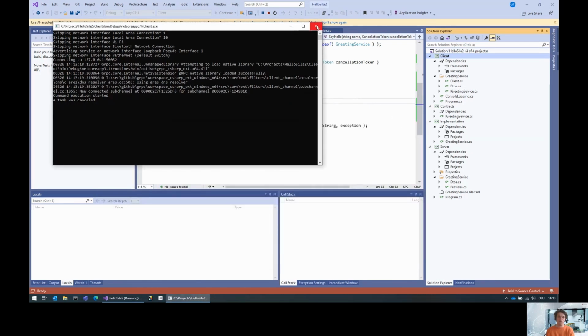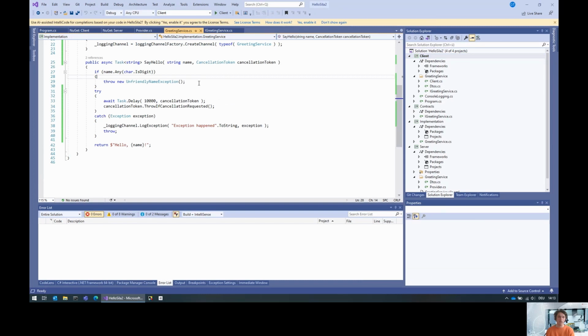Okay. And that's about it. You might wonder why the exception is not logged by default. And that is because somebody on purpose canceled the operation, and therefore that's not really worth logging. So if you have something that you want to see in the logs, you have to explicitly log it. The next version of the SiLA 2 SDK will do a bit more logging, but this version is pretty conservative on what is actually logged.